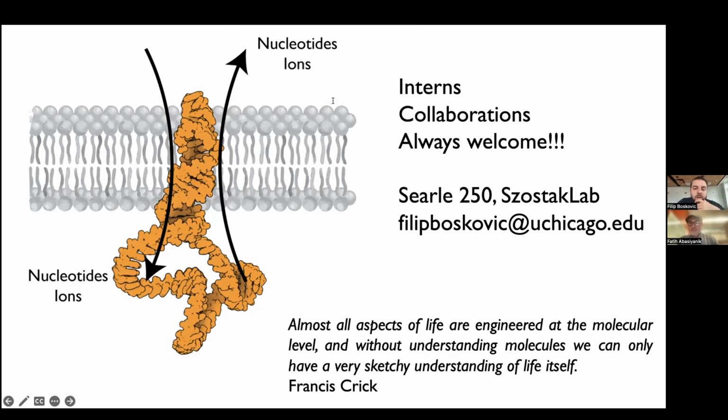Okay, so John Stelly has a question about adaptive sequencing, or adaptive sampling, actually. Can you select against in addition to selecting for sequences? In selecting for sequencing, can you only select for one or many sequences, and if so, how many? Can you also select for sequences at the 5' end of the sequence? Oh, these are really good questions.